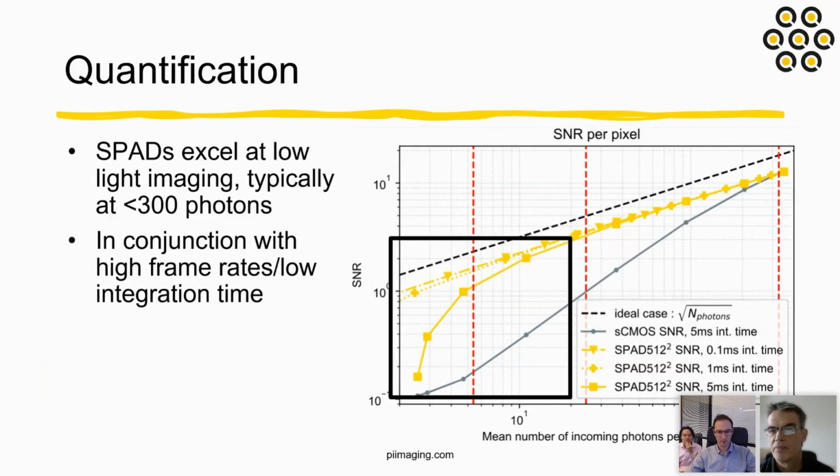Great, thank you. What is the size of an individual SPAD when imaging in 512 by 512? I believe the question is, what's the pixel size?